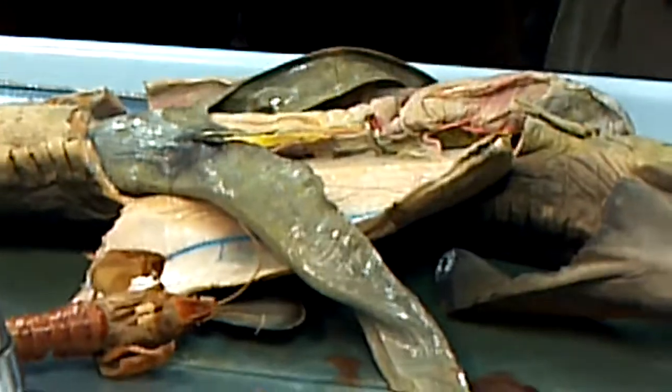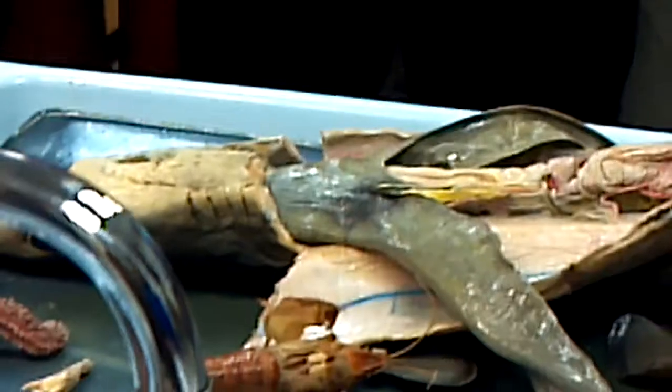His teeth have cut through my gloves. That is a sharp-toothed shark.